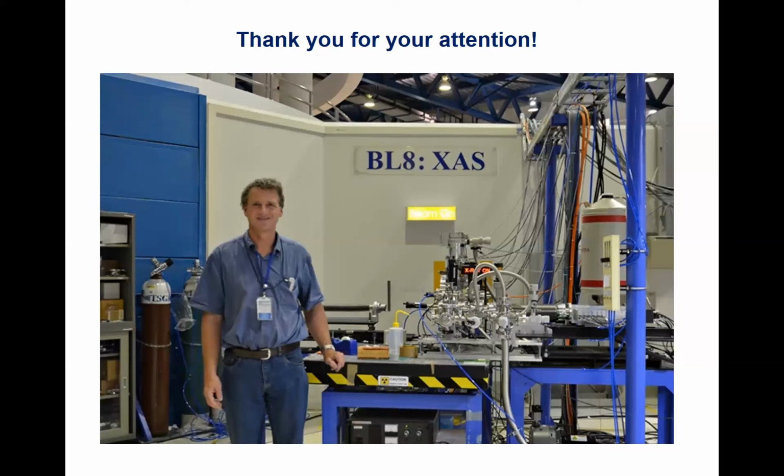The problem, as far as I know, is with self-absorption correction protocols. They work nicely in situations where you know what material you're working with. If you have the chemical and the quantum mechanical background, you can calculate what self-absorption occurs in your sample.